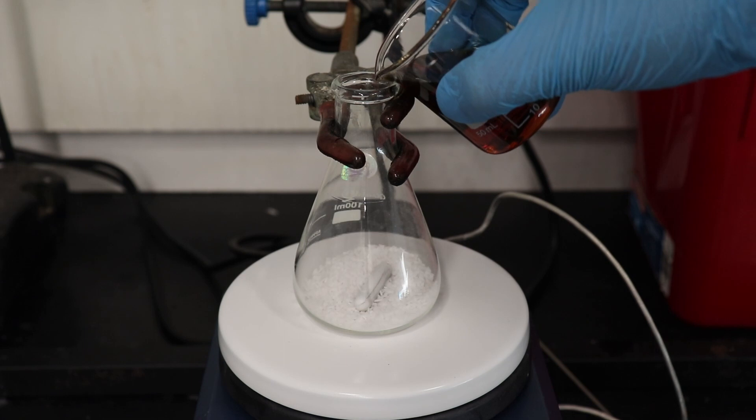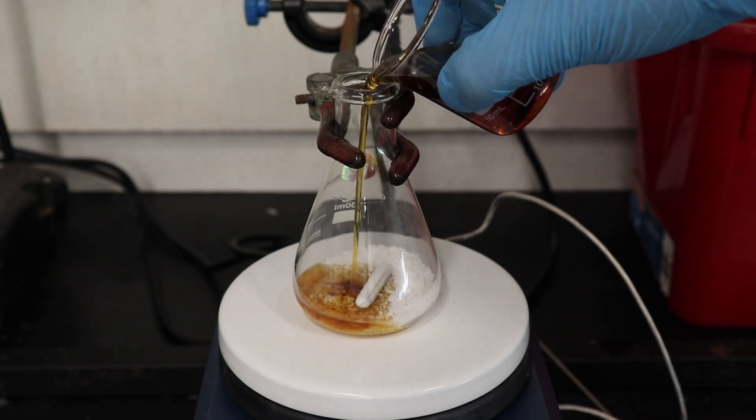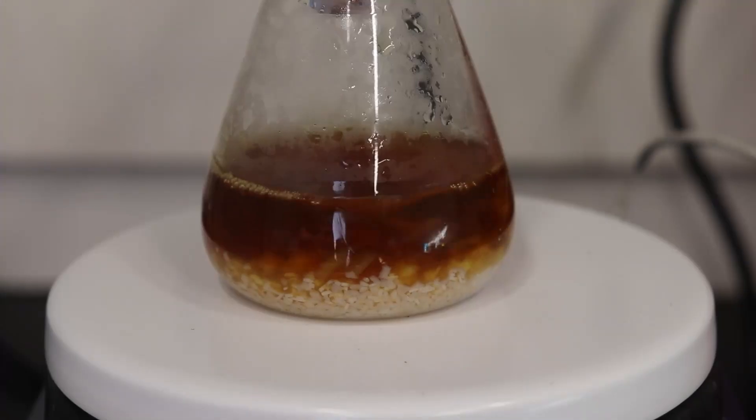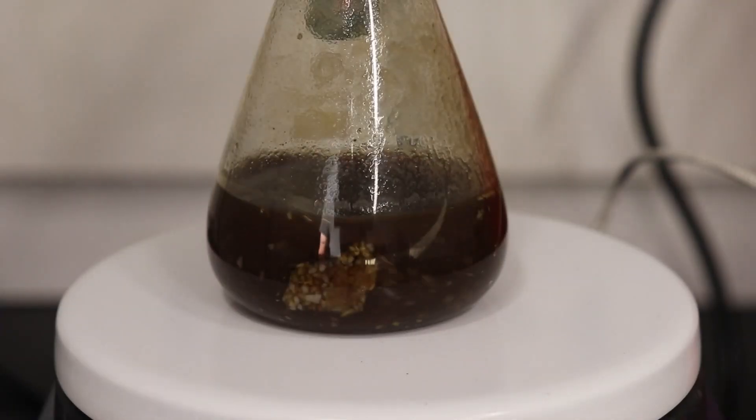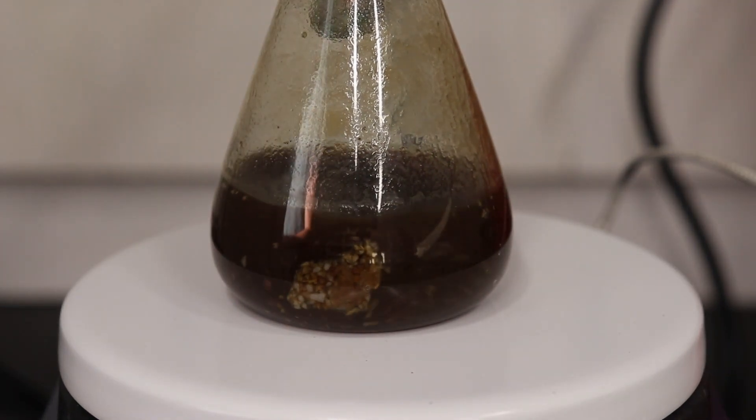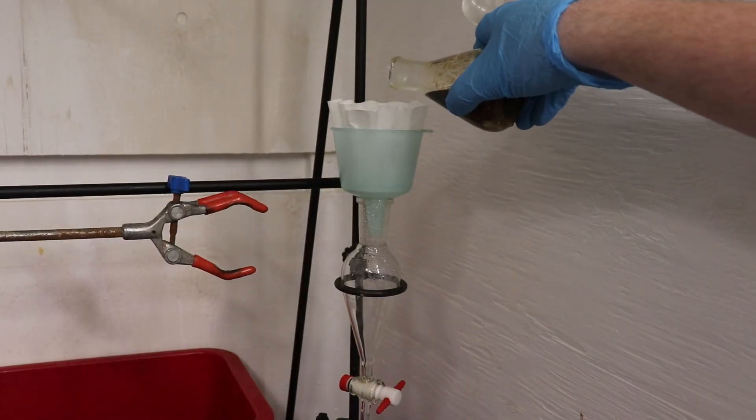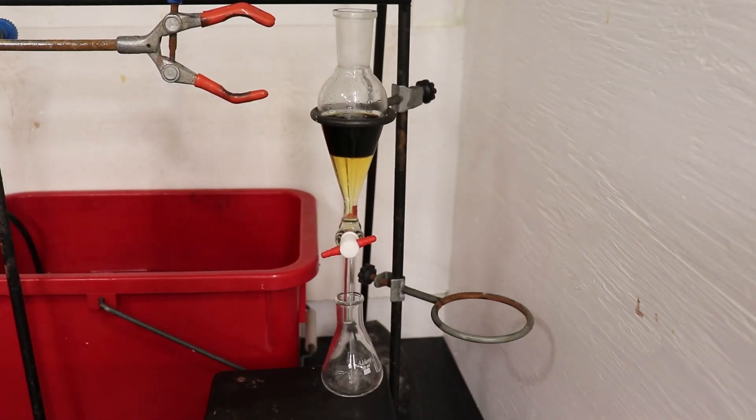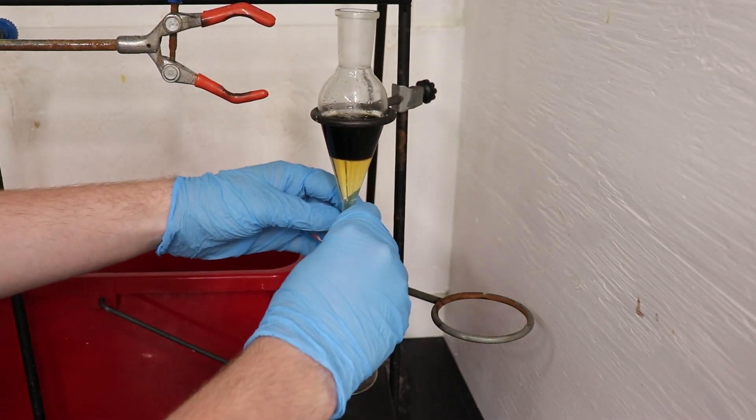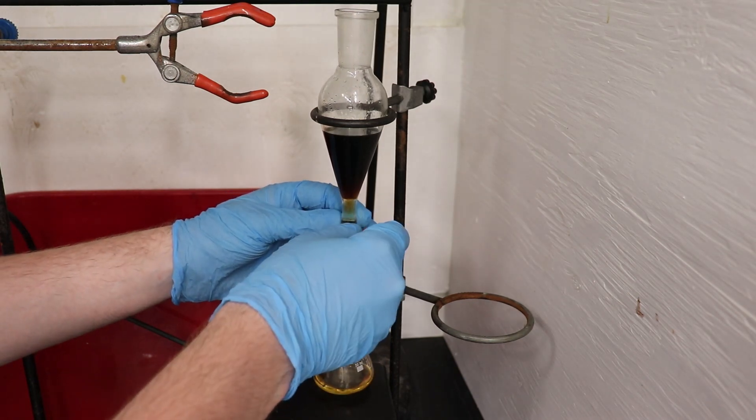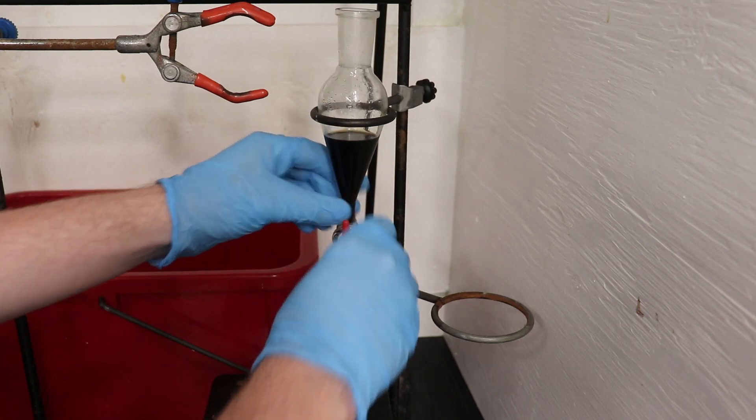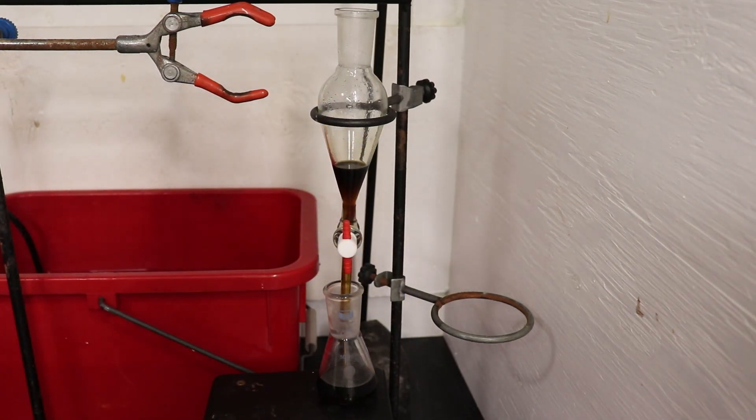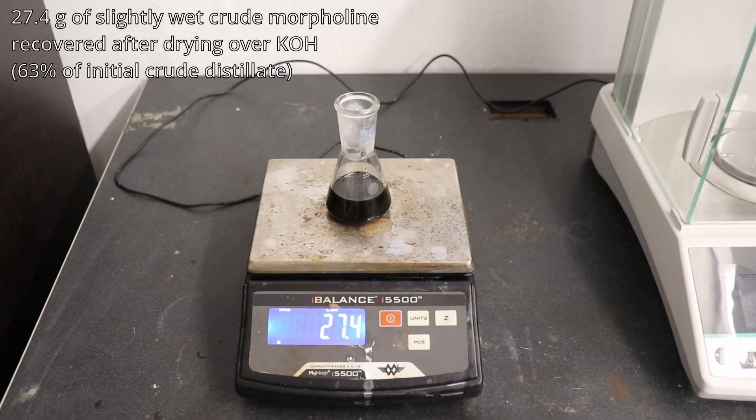To dry the crude morpholine distillate, it was stirred over 20 grams of potassium hydroxide for about one hour. The remaining solid potassium hydroxide was filtered off into a separatory funnel, and the lower aqueous layer was then discarded and upper morpholine layer transferred to an Erlenmeyer flask. The crude morpholine now weighed 27.4 grams after drying over potassium hydroxide.